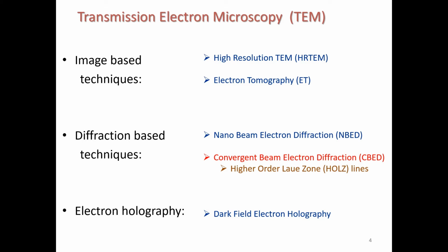Dark field electron holography is a technique which reconstructs the phase of the diffracted beam to study a strain inside semiconductors, although it only measures it in 2 dimensions. Several attempts have been done to simulate the 3rd missing dimension using the 2-dimension experimental information. The 3rd dimension is through the specimen thickness parallel with the beam direction.